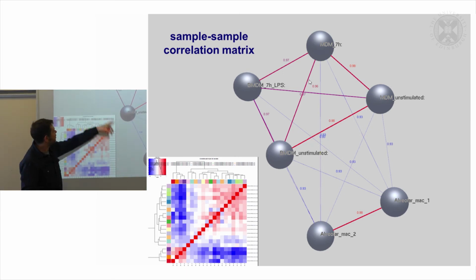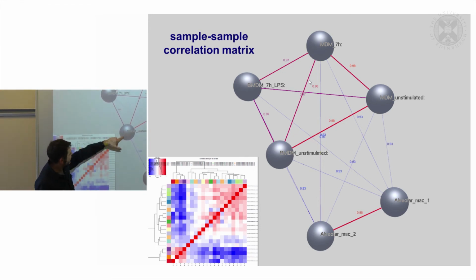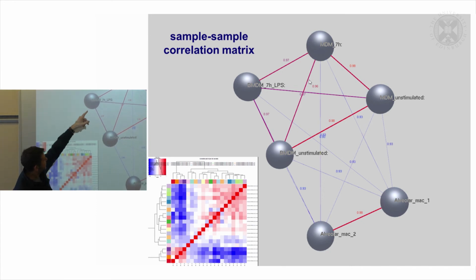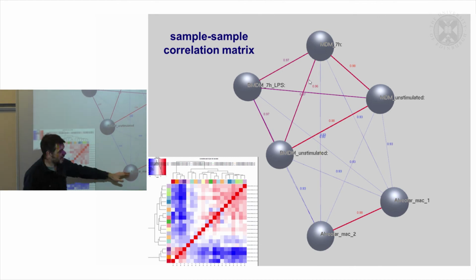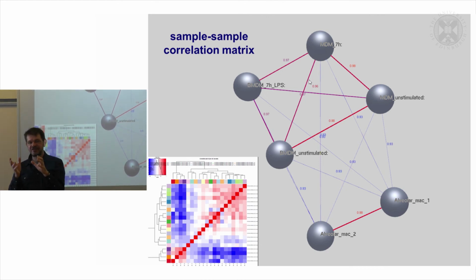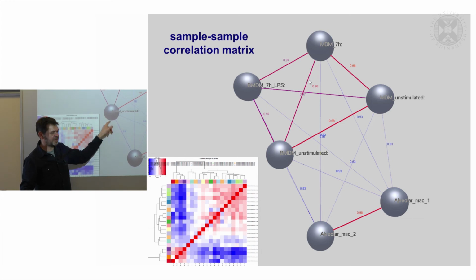This actually came from the pig atlas, where we've got bone marrow derived macrophages, unstimulated and with LPS. This is the unstimulated, and monocyte-derived macrophages, and the alveolar macrophages down here are related to other macrophages, but they're further away. So it's just a way of measuring things, and one thing I like about this approach is I get a measure of how similar samples are.